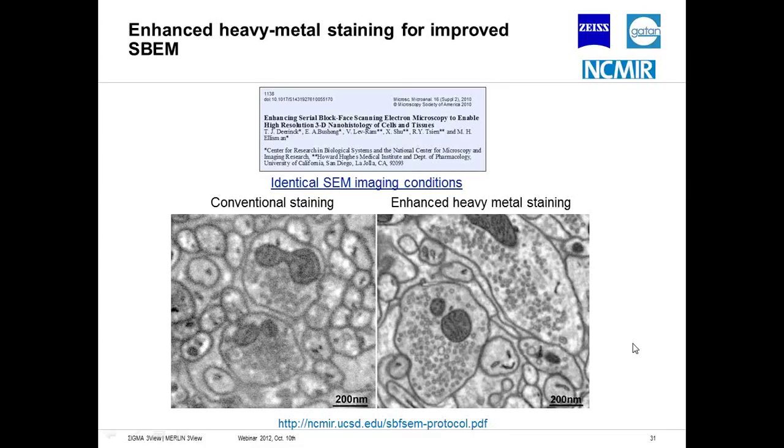It's been adapted for use in everything from cultured cells to worms to the first synthetic bacteria that Craig Venter invented to most major tissues. So it's also being used in many groups around the world. Even people doing dual beam and electron tomography are using it because the specimen contrast is so great. Now, if I can offer you one piece of advice, if you want to try your samples for review, you should use a protocol like this on your samples first of all, because it will make a big difference in the type of results that you can get.